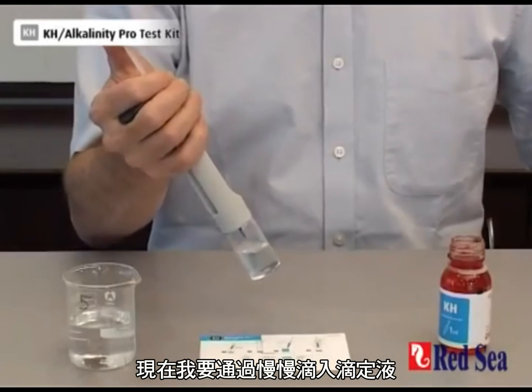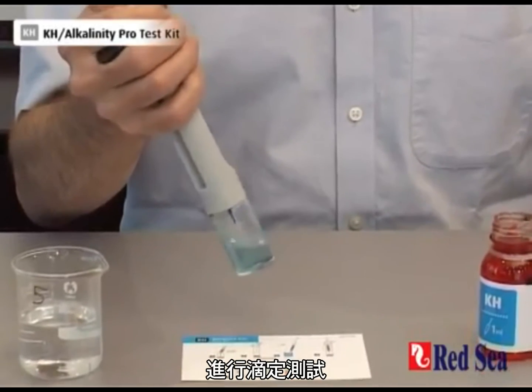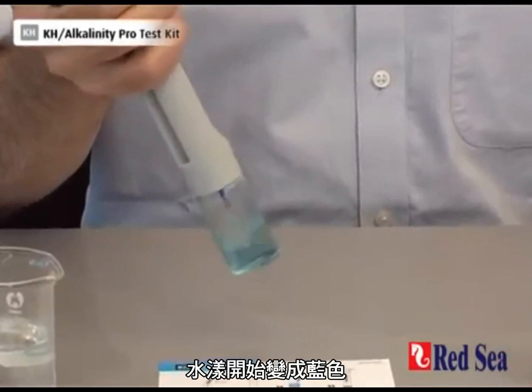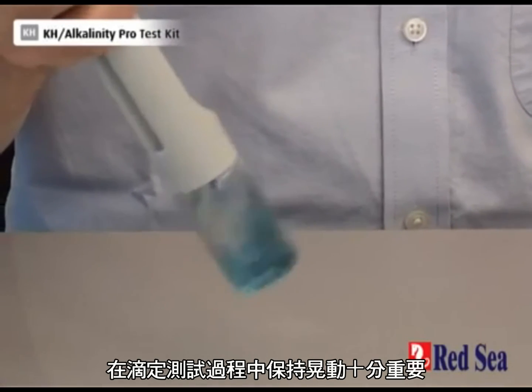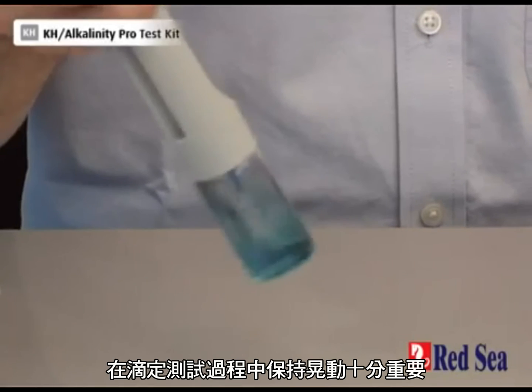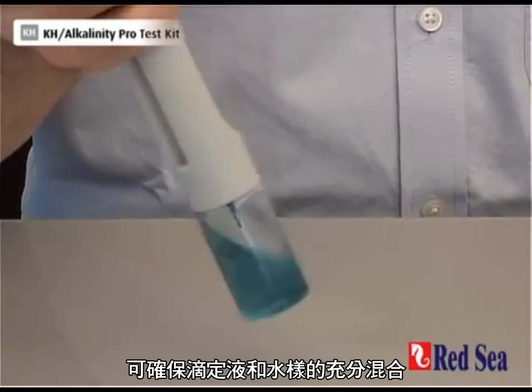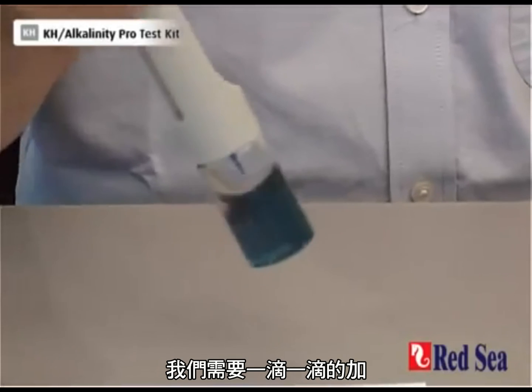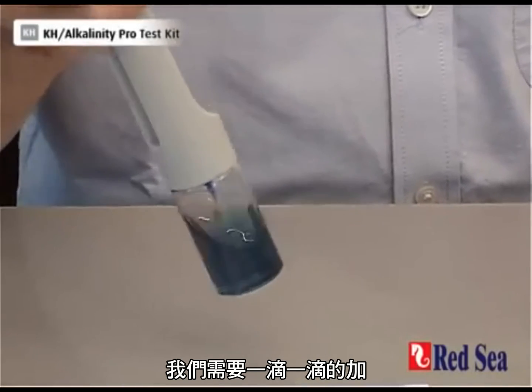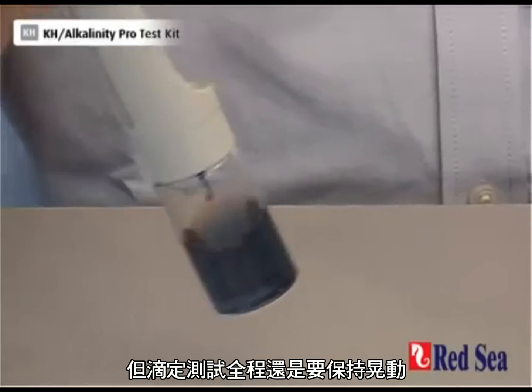I'm now performing the titration. As I slowly add in the titrant, our sample starts going a blue color, and I keep going — I'm looking for a nice pink color at the end. The important thing is to keep on shaking throughout the titration so there's good mixing between the titrant and the water sample. As we get closer to the end, we have to start adding drop-wise, making sure all the time we are shaking the sample.